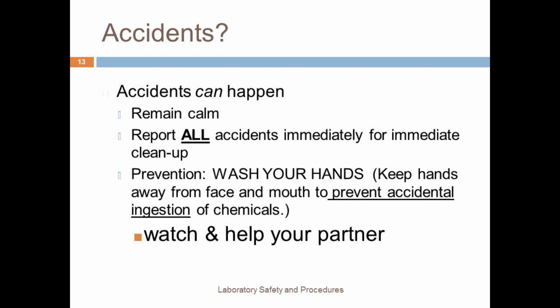If an accident does occur, and they can happen, first of all, remain calm. Then report all accidents immediately to your teacher for cleanup. For prevention, please wash your hands after lab and make sure that you do not eat during lab to keep the chemicals away from your face and mouth. Also, make sure that you're always watching and helping your lab partners.